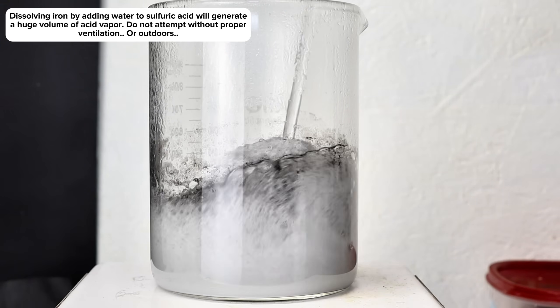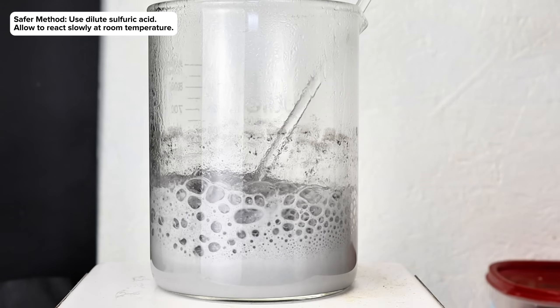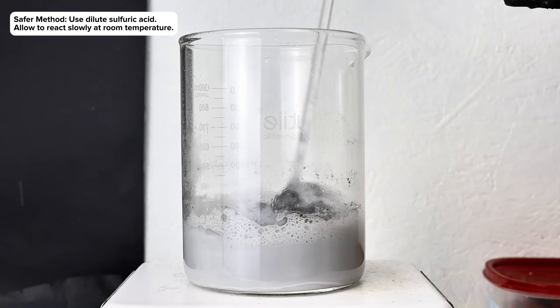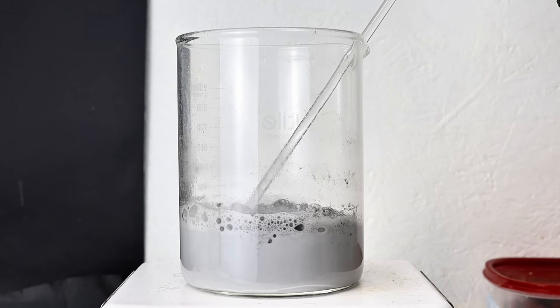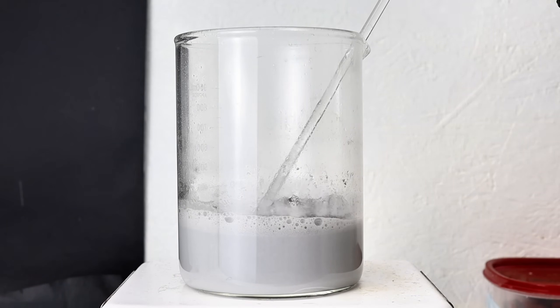Using room temperature dilute acid would be a lot safer, and I only did it the way I showed here because sulfuric acid creates an immense amount of heat when it's mixed with water, which allowed me to quickly dissolve the majority of the steel wool without needing any external heating.